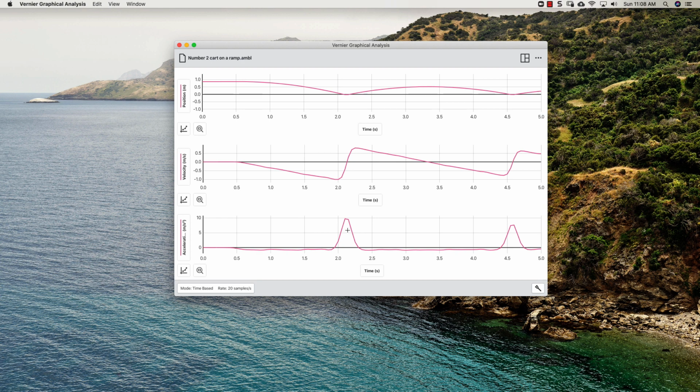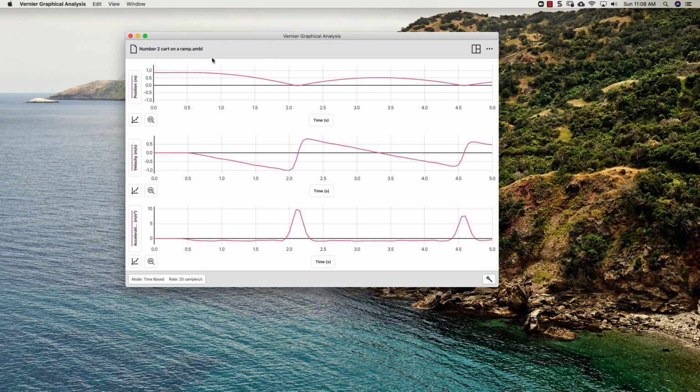Now, with this open, I'm going to show you a couple of things we're going to do. I'm going to go clockwise around. Let's start here. You notice this is the file we have open, and you got 5 things here. One is new experiment. So if you're doing something and you're getting things set up and you got some things open like this, go ahead and hit new experiment. You're going to get to an empty file. Open something up. Save this, and this will save to your Google Drive. So make sure you hit save.